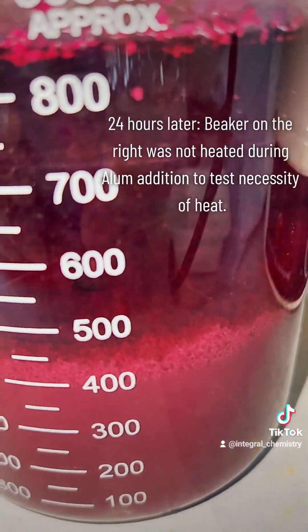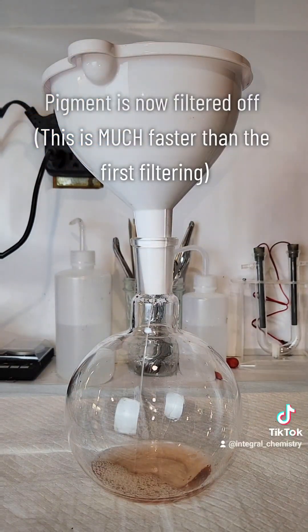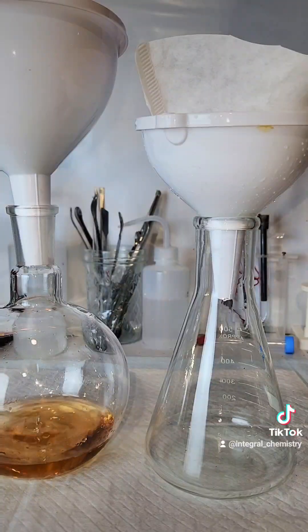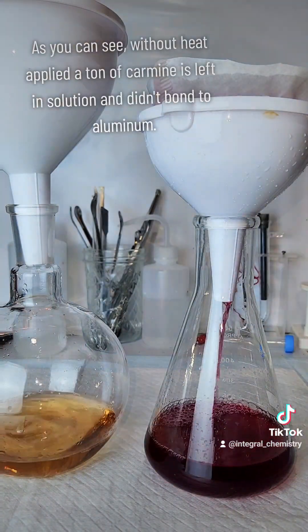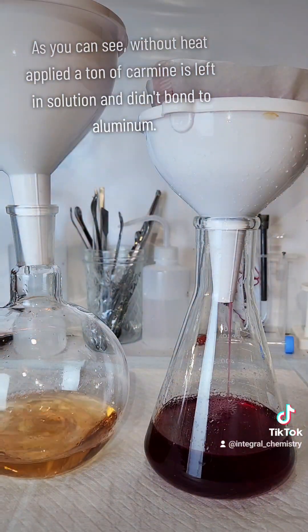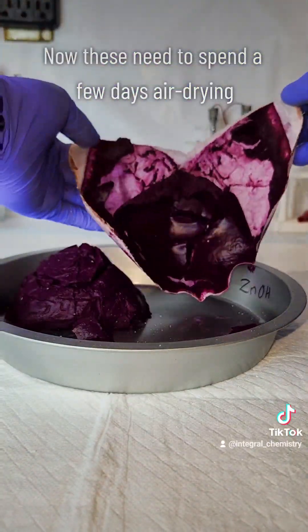Since I ended up with basically two liters of carminic acid solution after filtering, I decided to process one batch at 90 degrees Celsius and the other at room temperature to see if it made much of a difference — and you can see that it did make a pretty huge difference. The filtrate from the batch that wasn't heated is still very red, which indicates that a lot of the carminic acid didn't react with the alum to form the aluminum complex. I found out that the heating is not an optional step.